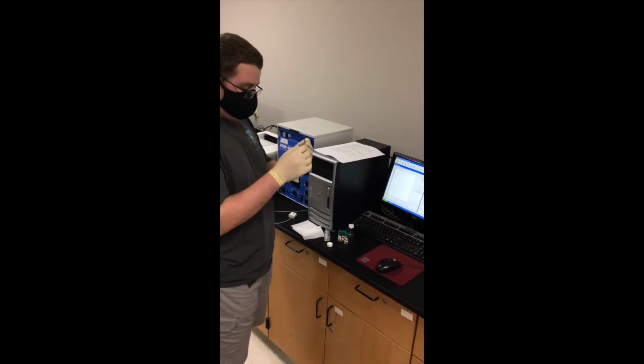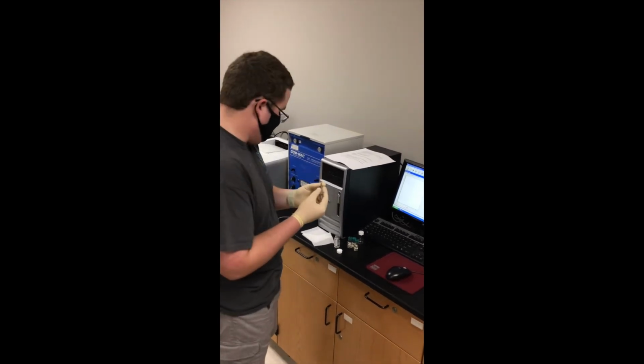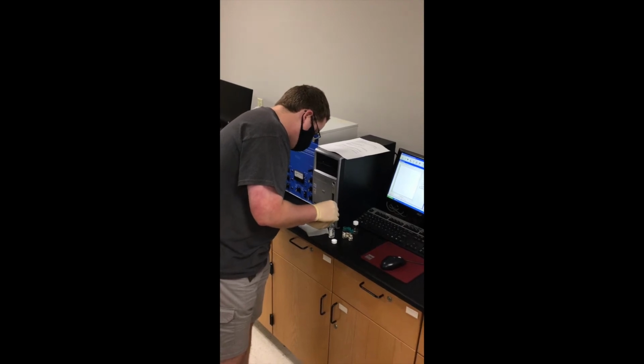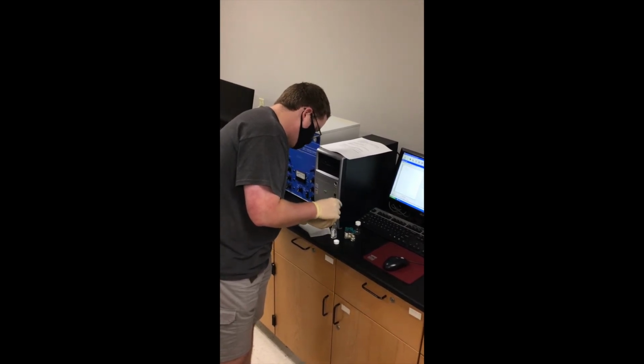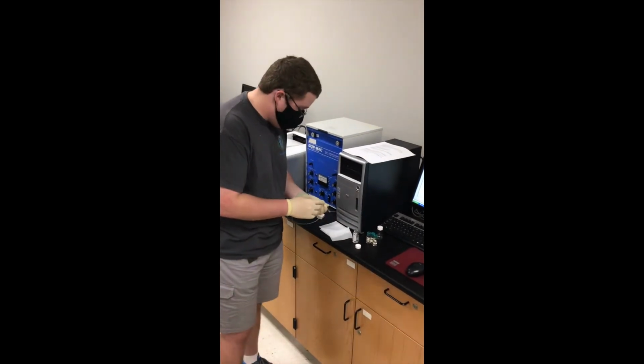Because it's so small, you won't be able to feel any resistance with the plunger and notice if it's been plugged on the other end. So you're actually going to have to check yourself. In this case, I'm going to pull up some hexane in here to verify that this works. You will do this for rinsing anyways, as you will find out through your procedure, but I'm going to go ahead and verify that this one still works.